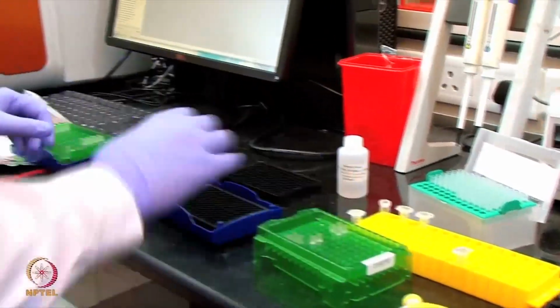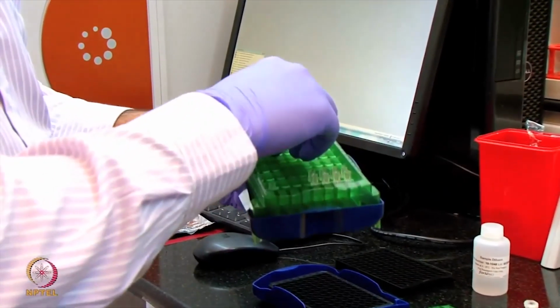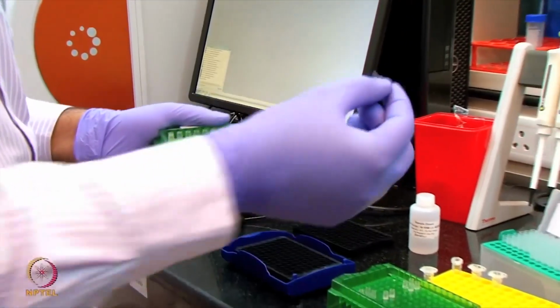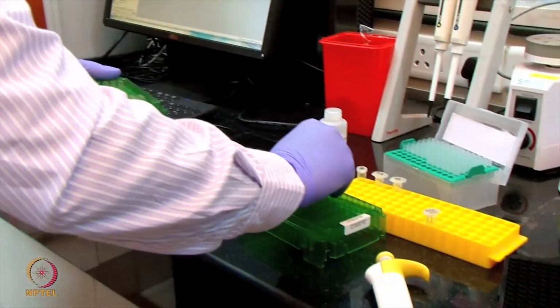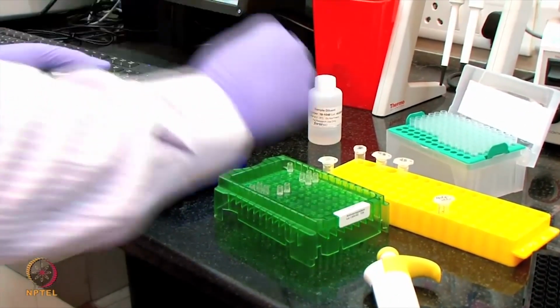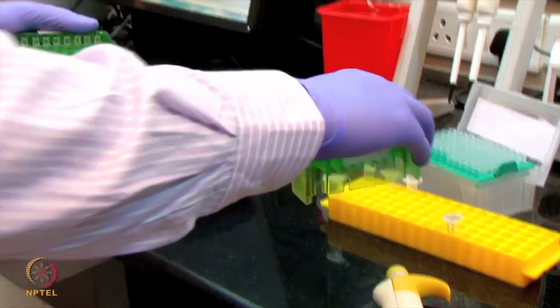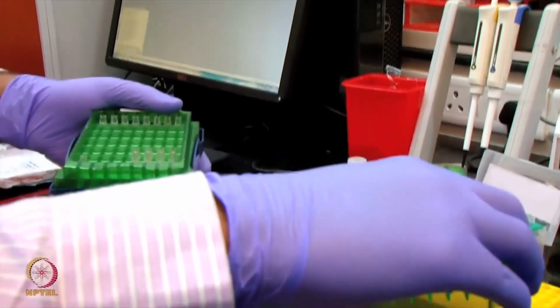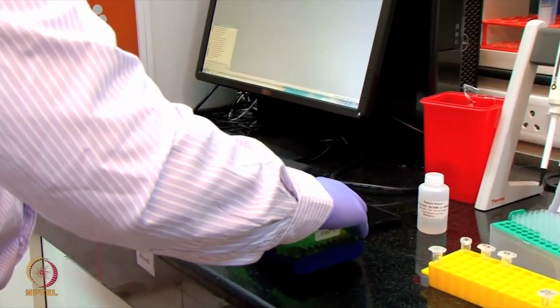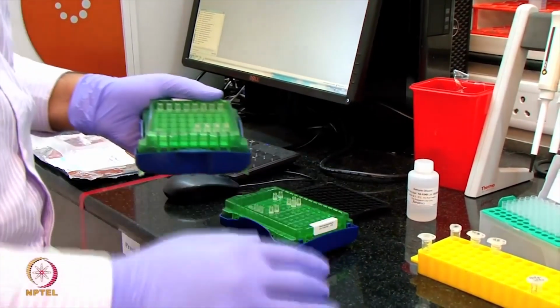Now, next step, I am taking the biosensors, which are the streptavidin sensors. These are the sensors, they look like this. I am going to put them onto the sensor tray. This is the sensor holder tray. I am putting the sensors like this. Now I am keeping this sensor tray for hydration for 10 minutes. So now I will set aside these sensors for 10 minutes.